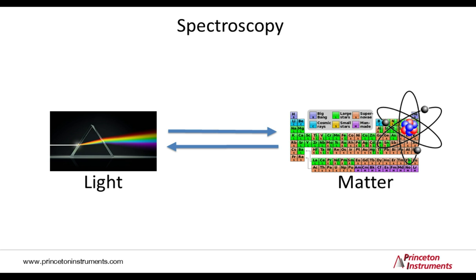So let's talk about spectroscopy. Generally speaking, spectroscopy is the investigation of matter using light. In the simplest example, I might just understand this as looking at an object, detecting light with my eyes. Typically, I mean the analytical study of how materials react when being exposed to light of different color or how they emit light.